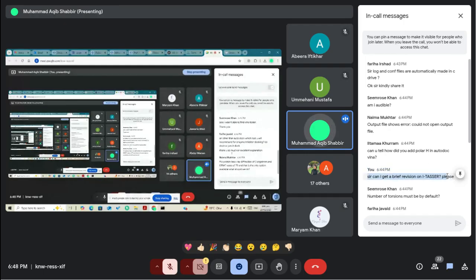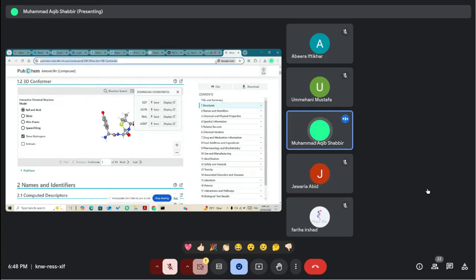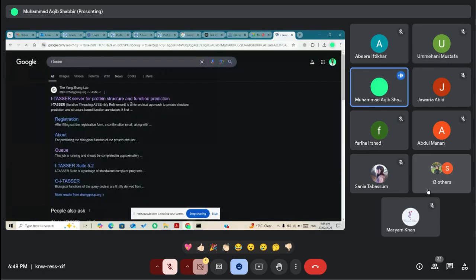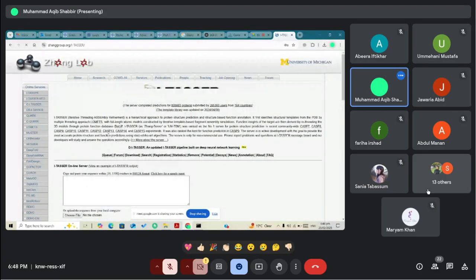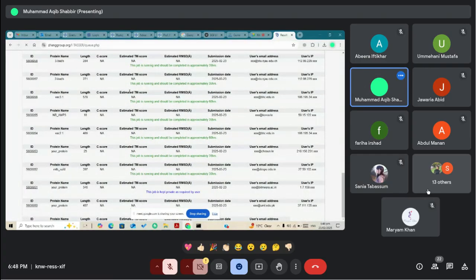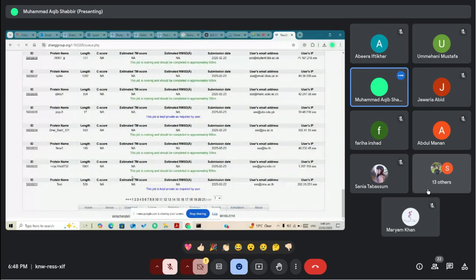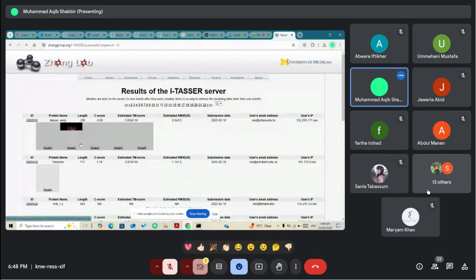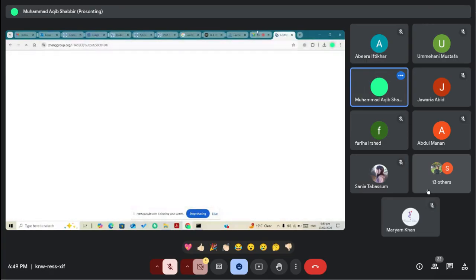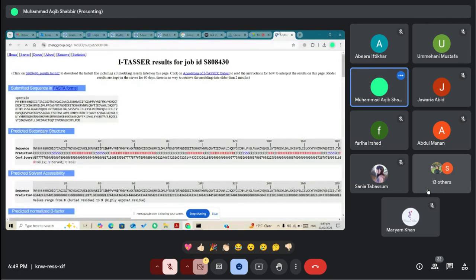Okay, Mariam. So I can just give you a very brief overview of I-TASSER. So we will just move to the results directly, and I can explain the results in a brief manner. Okay, here you can see the results page of I-TASSER.